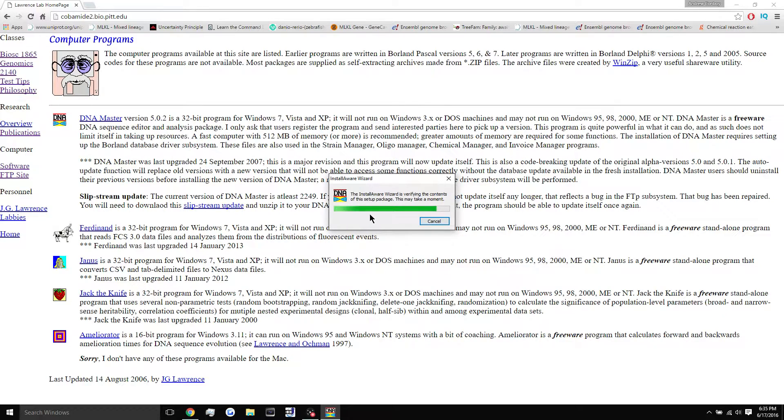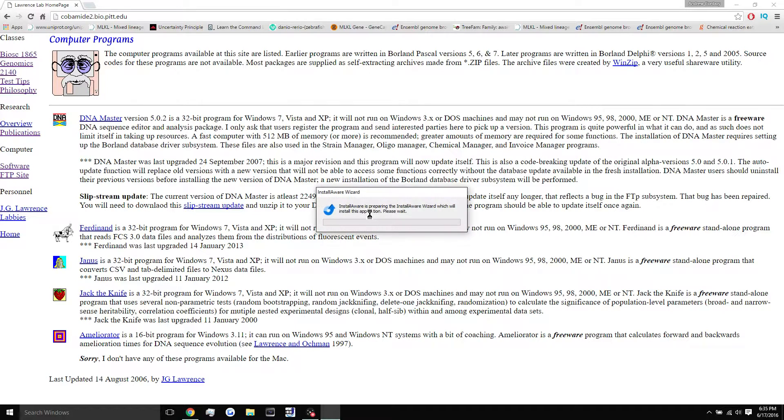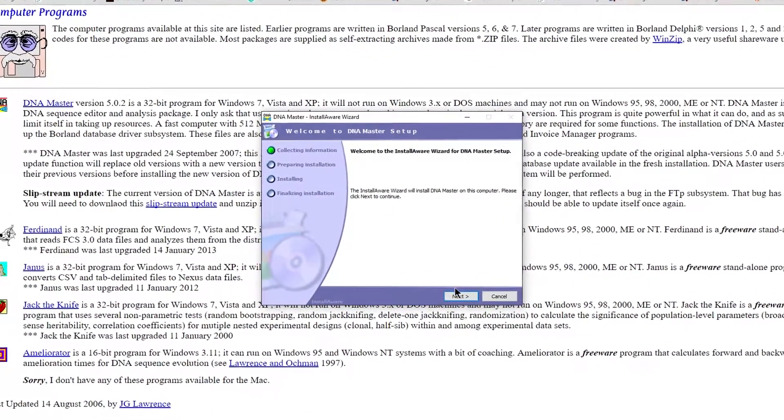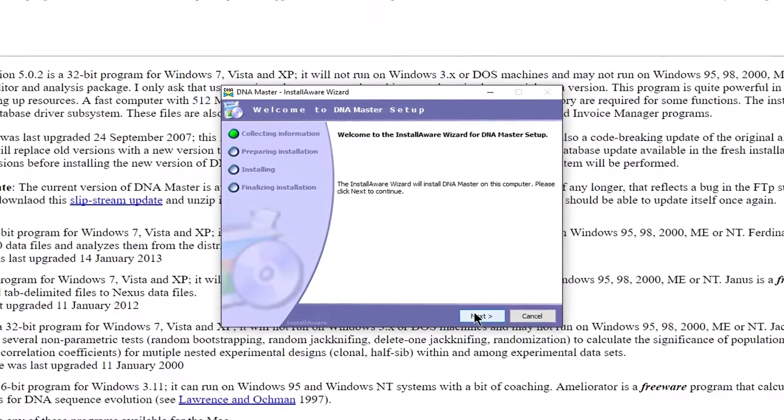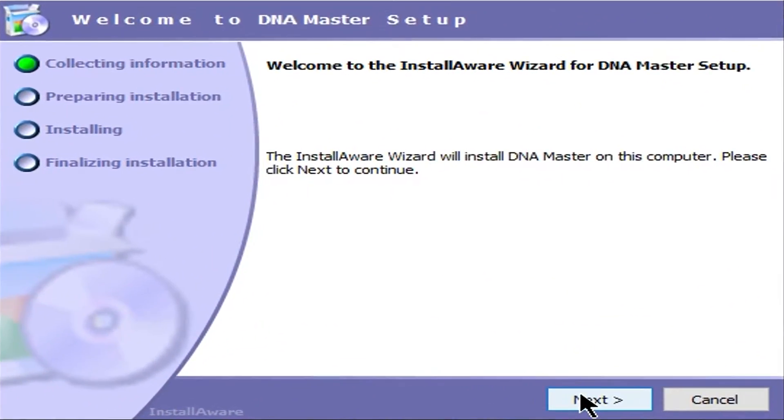So if you are using a computer that multiple people use, say a family computer or something like that, make sure you're on the administrator account or that you give the program administrator permissions, because you're going to need that every single time to run the program. So just a heads up with that.